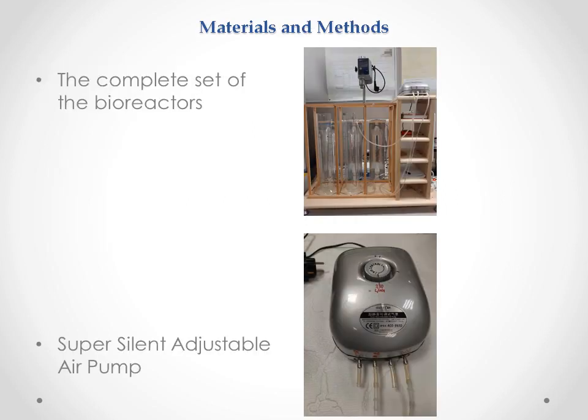The materials and methods used in this study. In the first image, you can see the complete set of the 3 bioreactors that we installed in our laboratory. Then the second image is the super silent adjustable air pump with a power of 10 watts and a maximum output of 10 liters per minute.